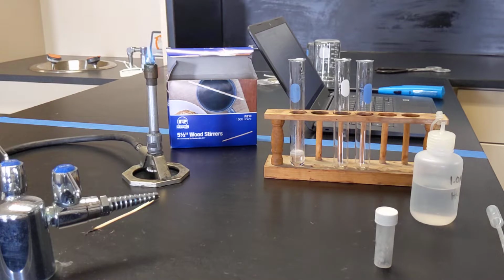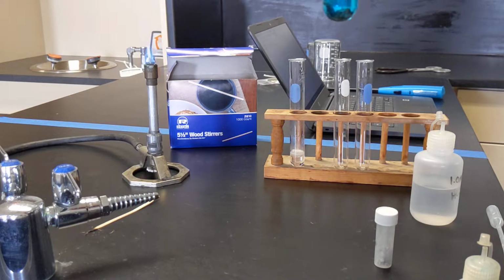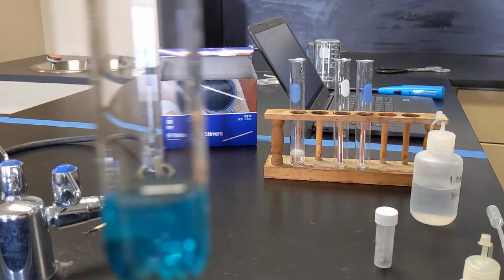Ta-da. Okay, so I have put the copper chloride in with the zinc.